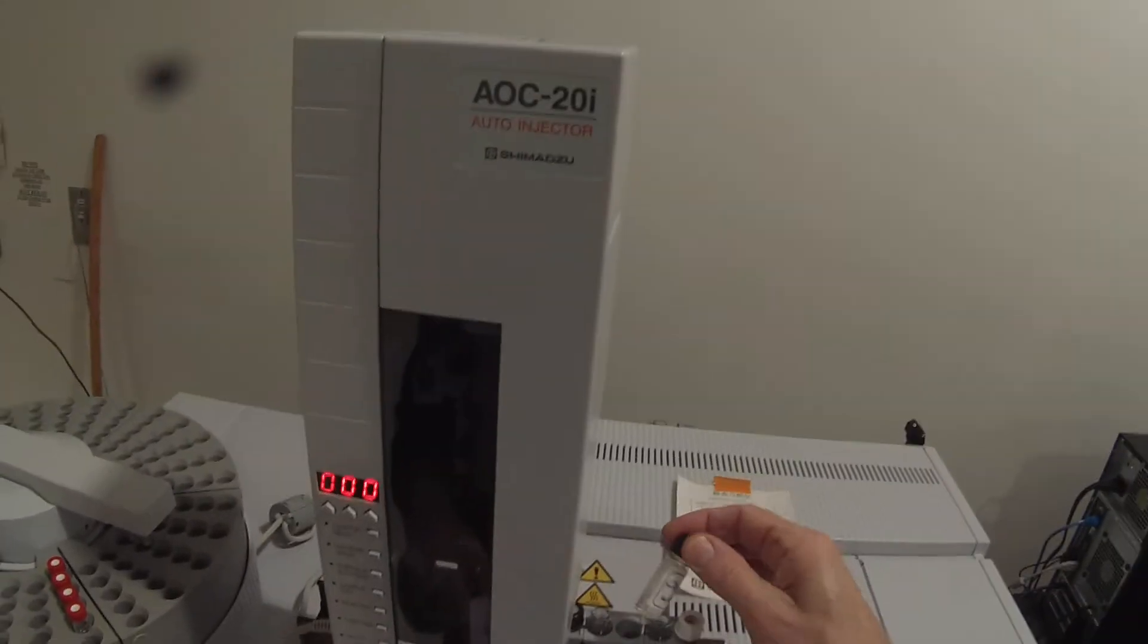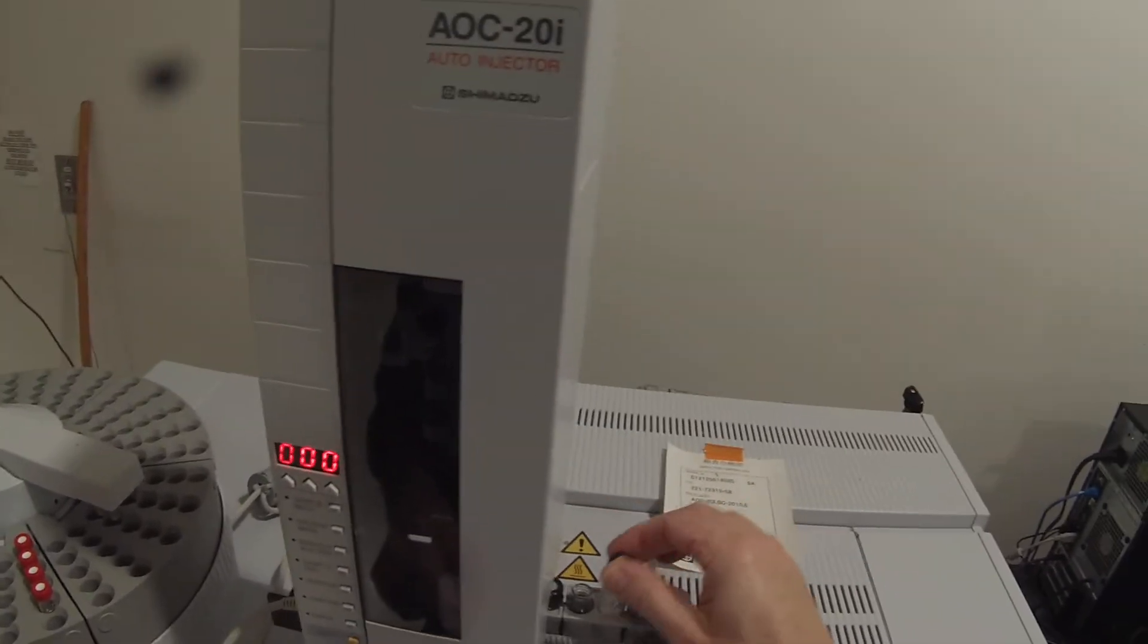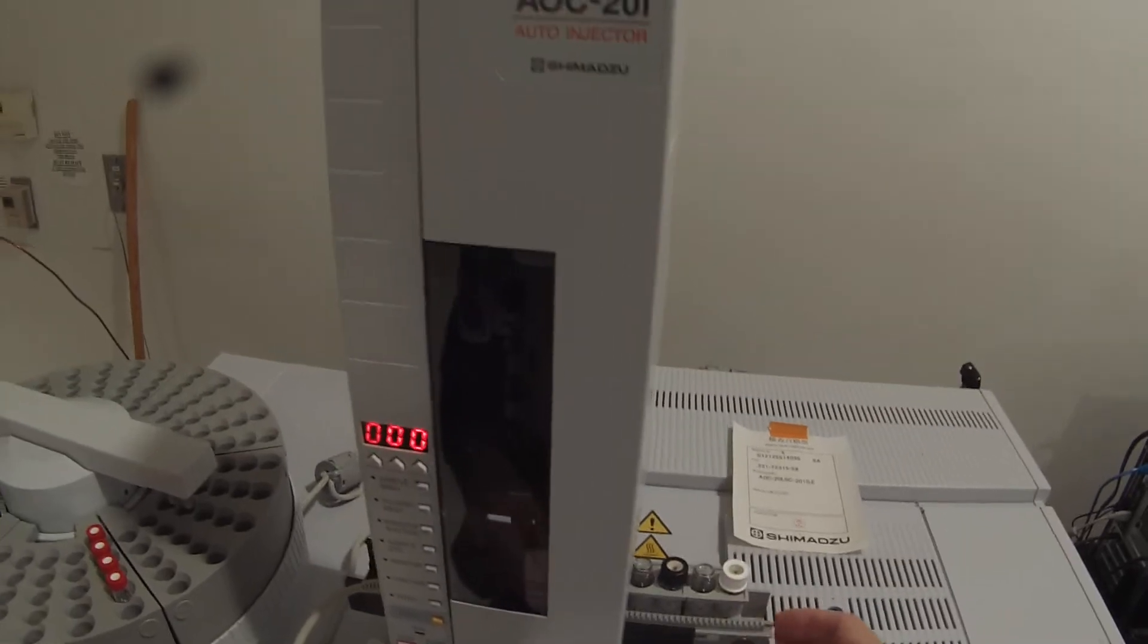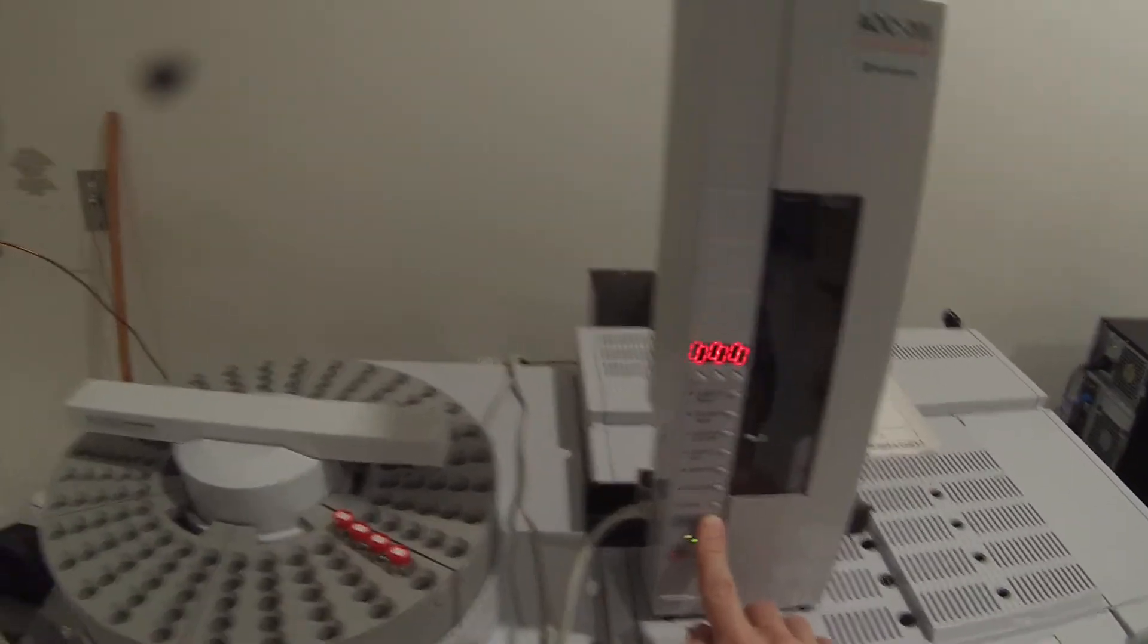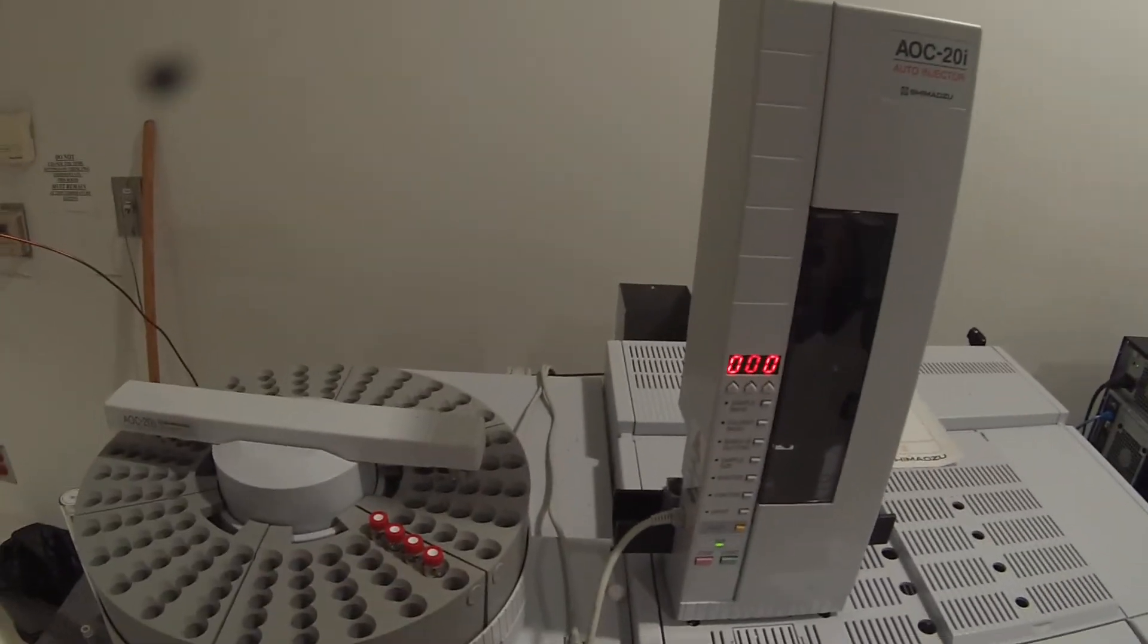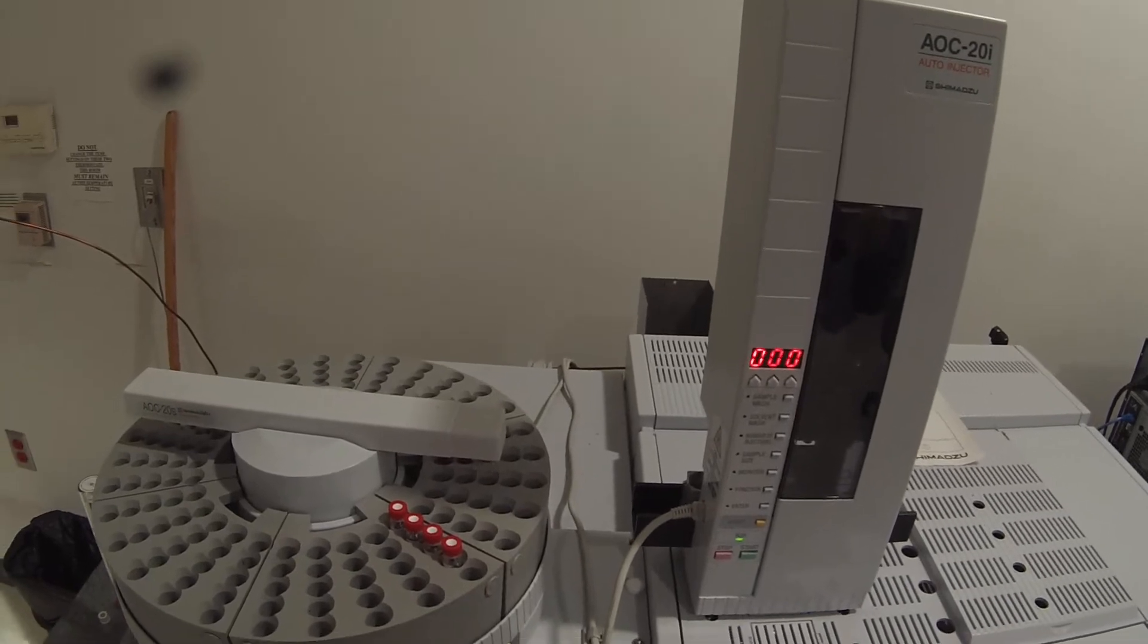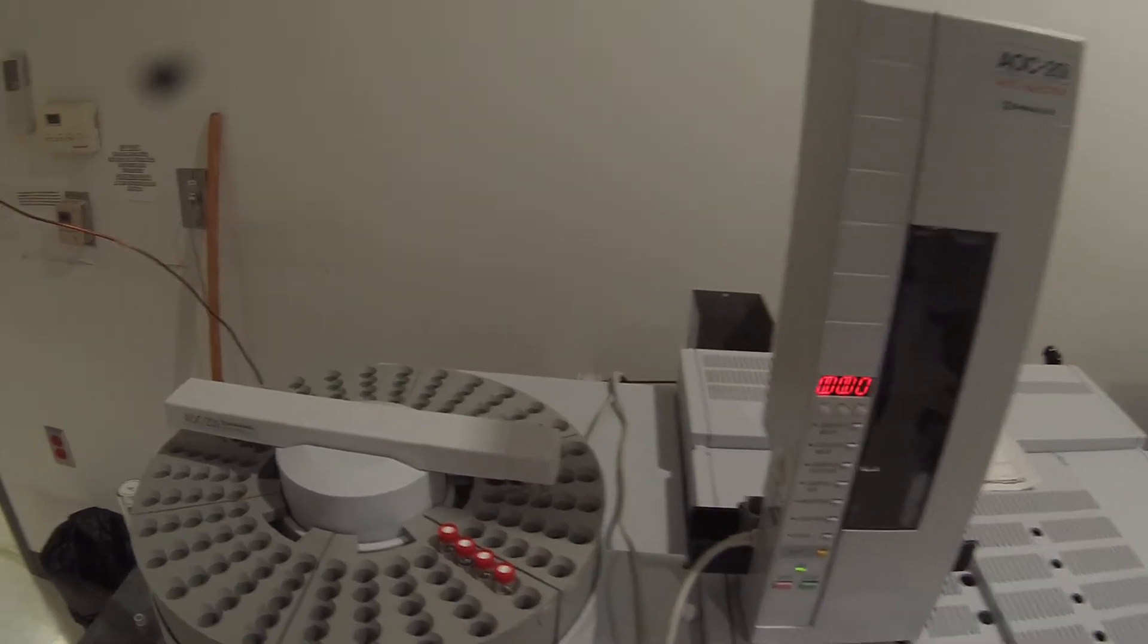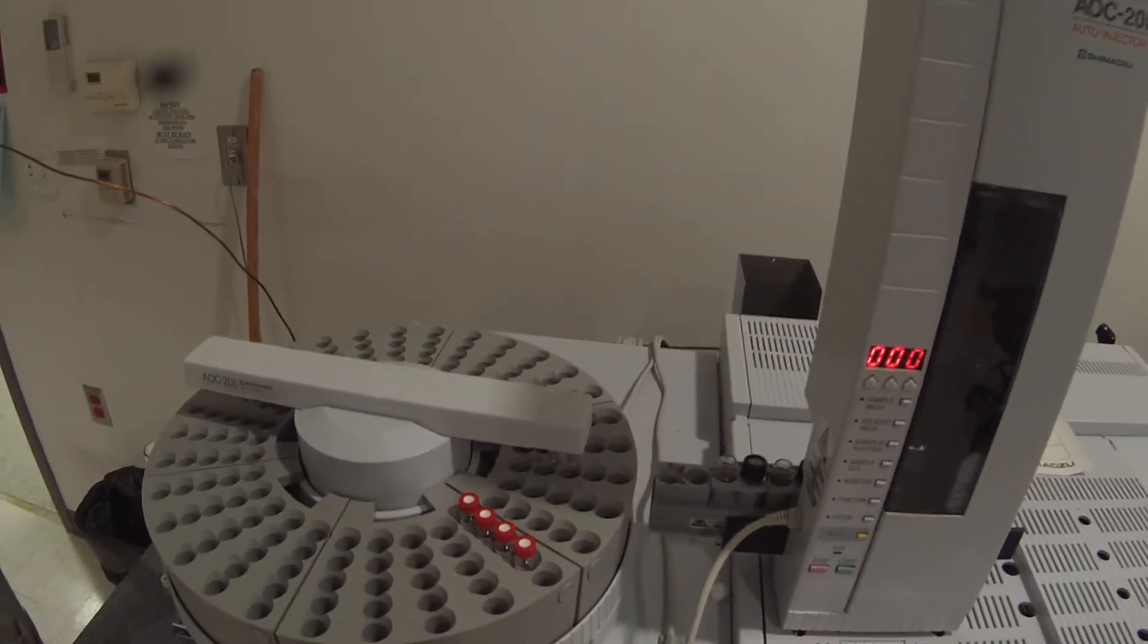Solvent B is dichloromethane. I'll need to refill that. And solvent C is acetonitrile. So we'll just reset that guy. That should be ready to go.